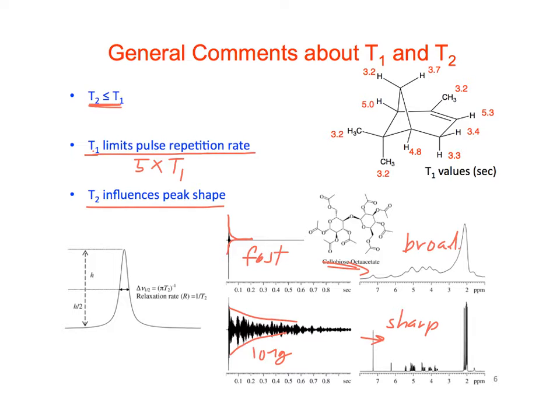You know, in fact, and I don't know, when you guys run NMRs down there, do you watch the FID acquire? You can, if you set it a certain way. Right, because I know when I used to, you'd always see the FID, and sometimes it would be very long if the shimming was very good. You could have a very nice long FID, but one time you go down in there and the shimming's crappy or something, and then you see it's relaxing really fast, and then you end up with a terrible looking spectrum, right? It's all broad and everything.